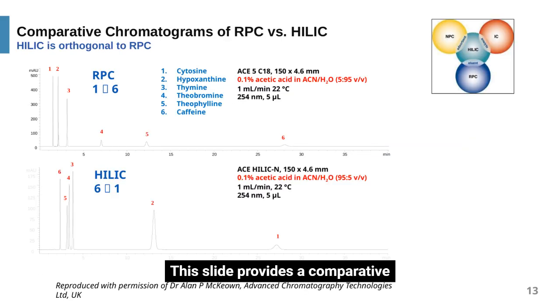This slide provides a comparative look at chromatograms of RPC versus HILIC. The HILIC method shows an orthogonal separation compared to RPC.